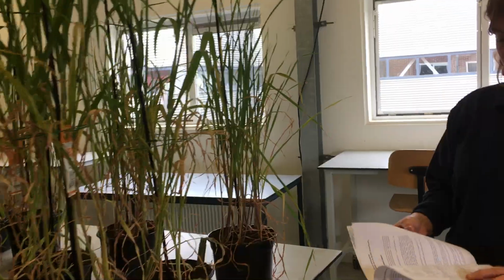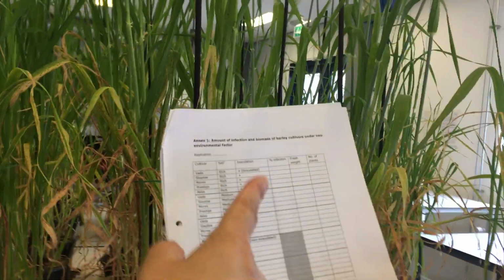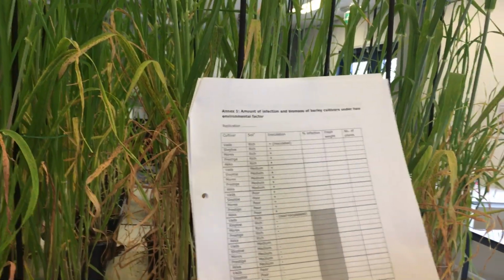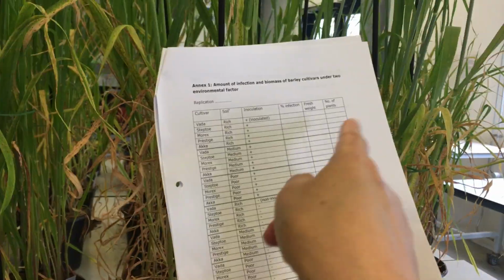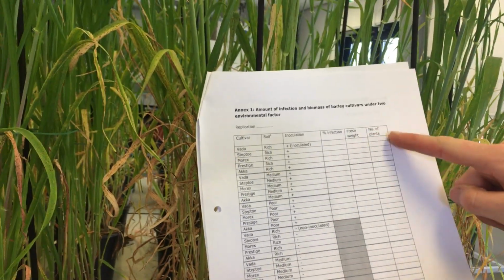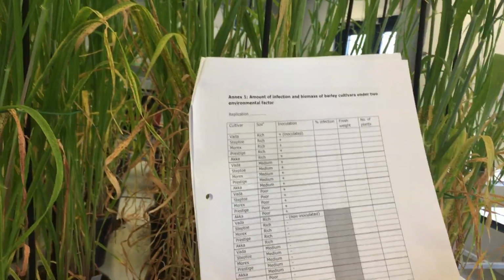You can write down. We have a table. Pauline will show that. So there you have a table. Then you will write down the infection rate in this column. That's the infection. Then you also need to note down how many plants are in the pot. Then we are going to measure the fresh weight.